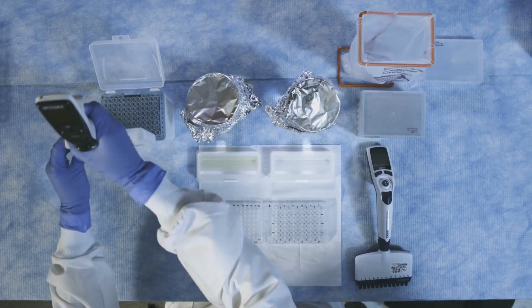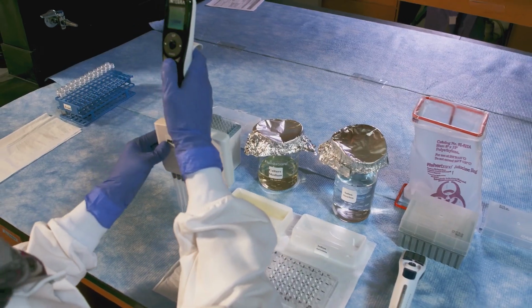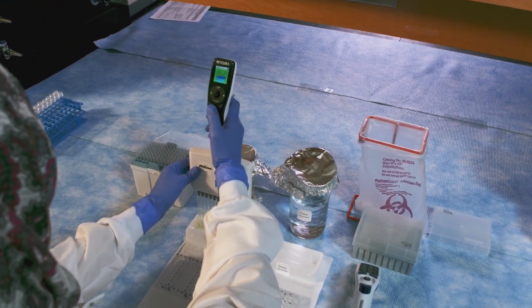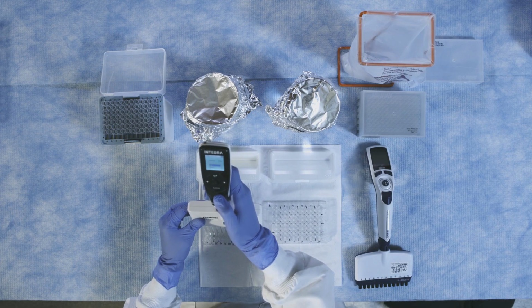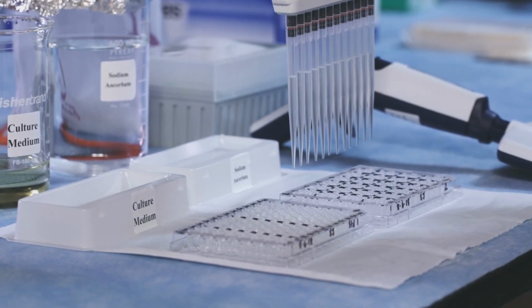The first 2 reagents that need to be added to the 96-well plates are the growth medium and the sodium ascorbate solution. Use a 12-channel electronic pipette, 1,250 microliters, with the repetitive pipetting function and volume set to 200 microliters to add 200 microliters of growth medium to all plates.